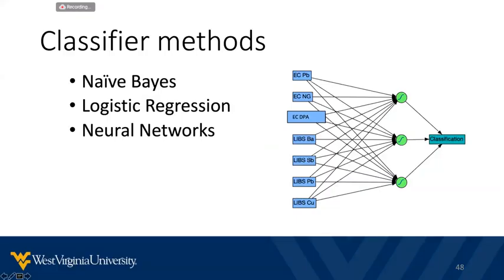3 supervised classifier methods were used in this study to evaluate their ability to predict class membership: logistic regression, naive Bayes, and neural networks. K-fold cross-validation was repeated several times. This means that approximately half of our data was used for training and the other half for testing. The training and testing data sets are selected randomly. Therefore, to avoid the results being driven by a single random selection, the procedure was repeated several times and the average performance was reported. The results of the algorithms provide confusion matrices.